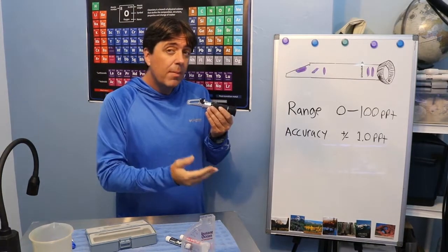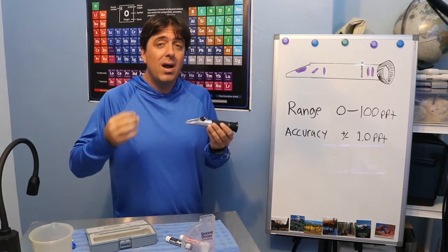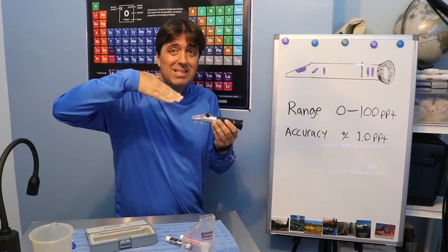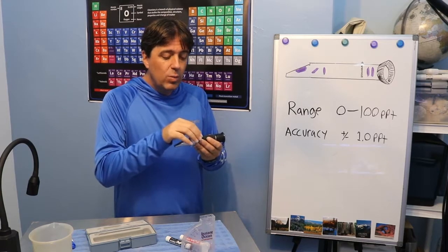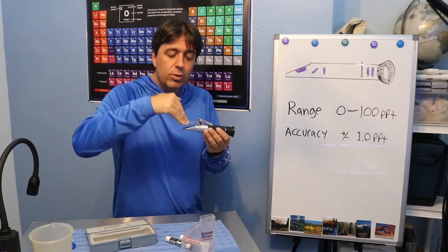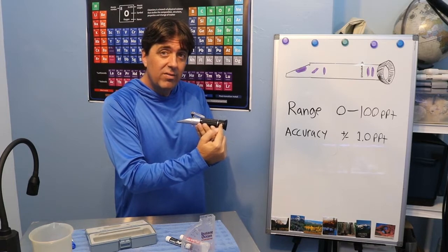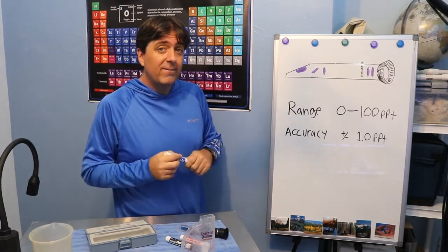Now, a refractometer works because it uses the idea that as there is a higher amount of inorganic constituents in the water, the light will actually bend differently as it passes through. So when we put water on this glass plate, the light is going to go through it, get bent, and then get collected and piped through the rest of the instrument. So let's look at this in a diagrammatic form.